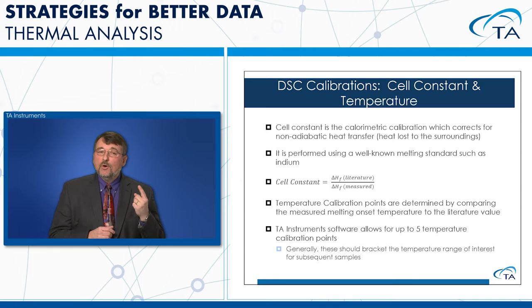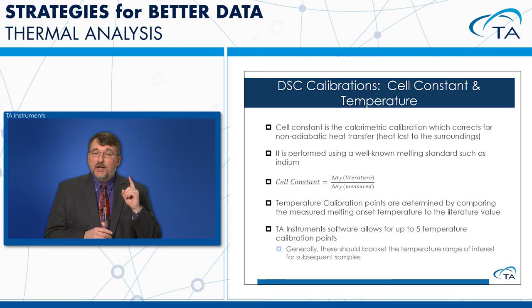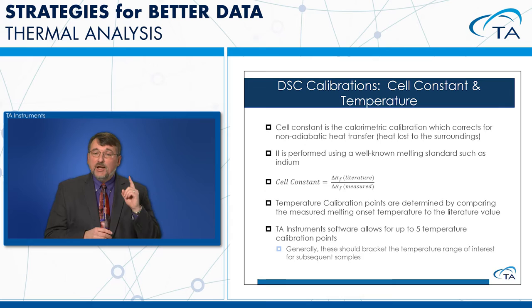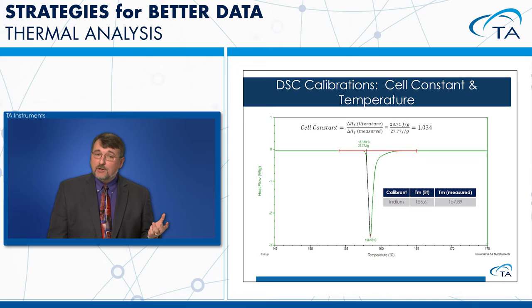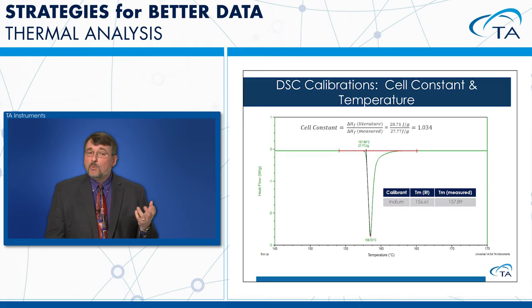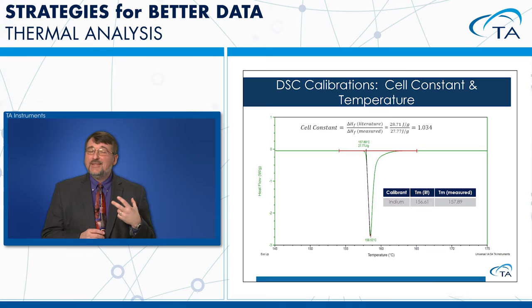Here's an example of an indium calibration run for cell constant and temperature. Integrating the peak, we get a measured heat of fusion of 27.77 J/g against a literature value of 28.71 J/g, giving a cell constant of 1.03 — right around one, slightly above, which is a very good result. For temperature calibration from the same file, we measure an onset of 157.89°C compared to the literature value of 156.61°C, so we apply a correction to get the right temperature.